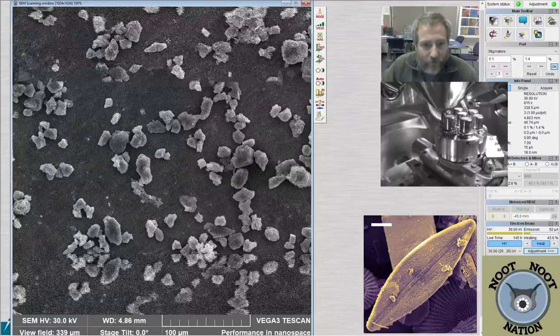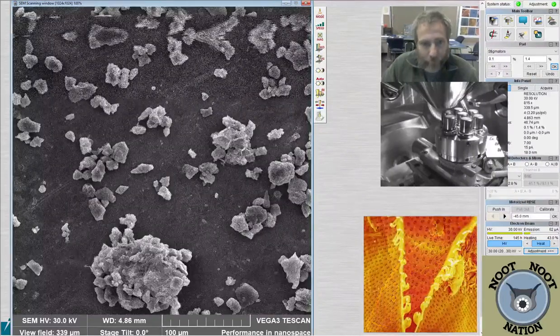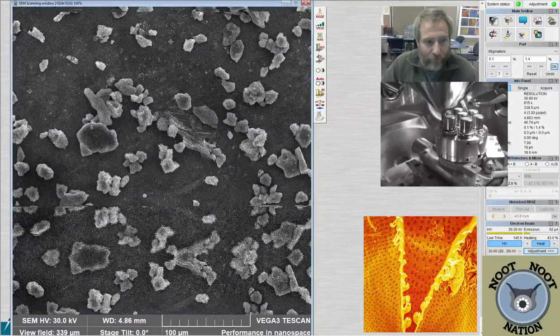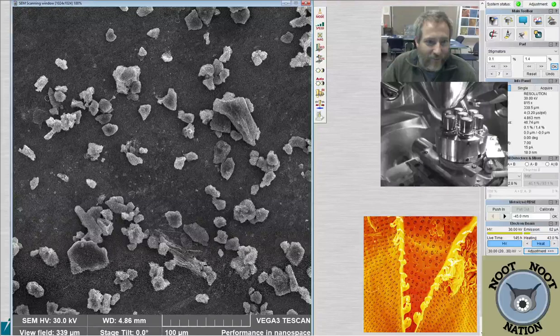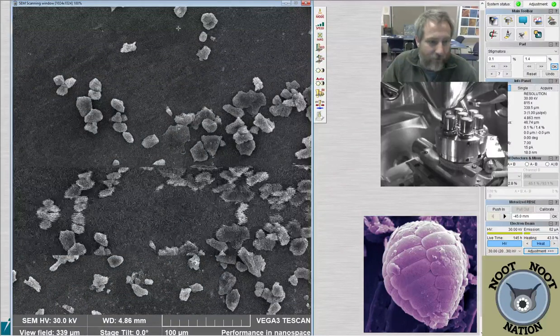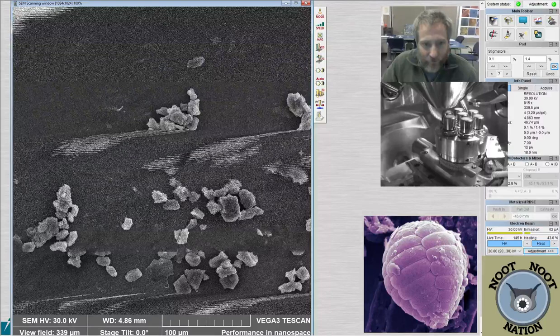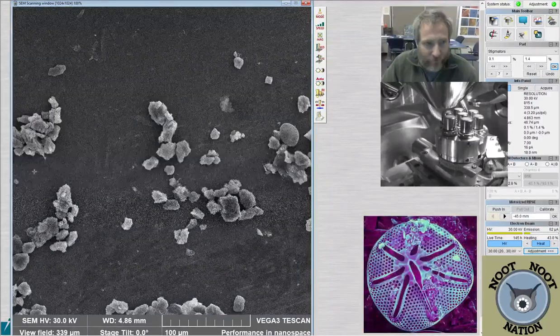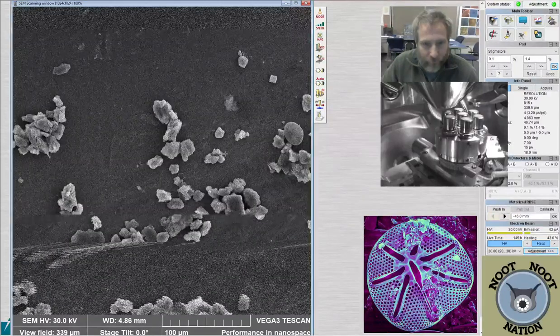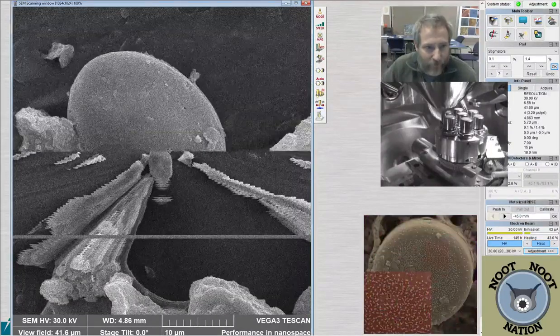It's not to say that you can't identify diatoms to species without an SEM. I did it for many years before getting one. But in some cases, it's hard to tell what the species is, and so you end up putting it in like a cf., like it looks kind of like this, compare it against something like this. And that's fine if you're just trying to get a general handle on what you're looking at, but probably not great for trying to infer actual information about a diatom.